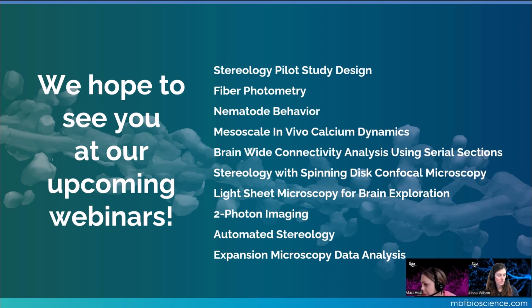And then the second part of that question is when there's more dense labeling of cells as opposed to what you saw, which was the Thy1 GFP. And again, we really try to make the software flexible for different types of inputs and different complexities. So again, using those settings to improve the accuracy of the tracing, or even using user-guided methods for really complicated areas is possible.